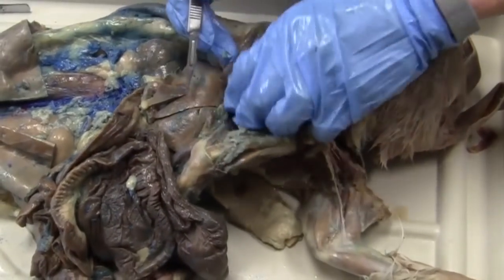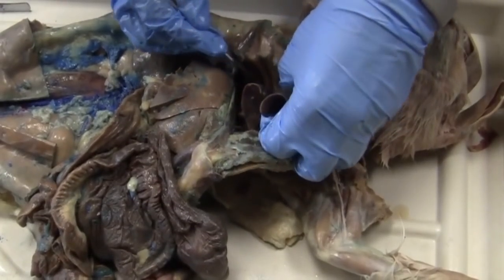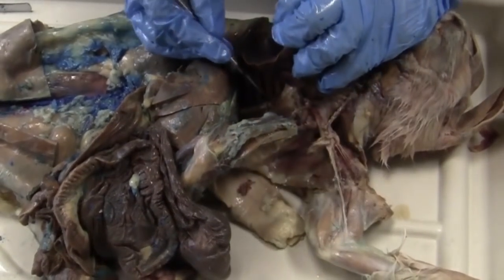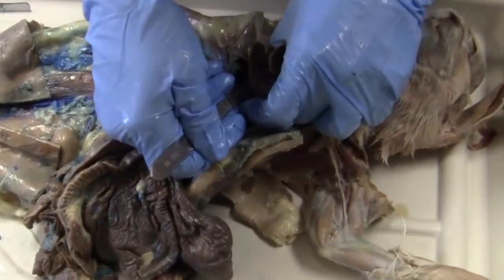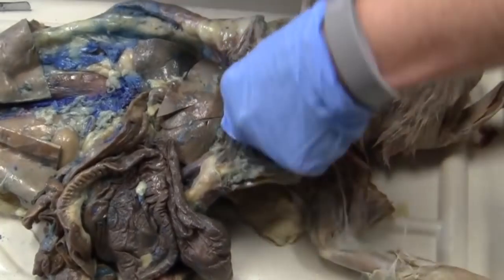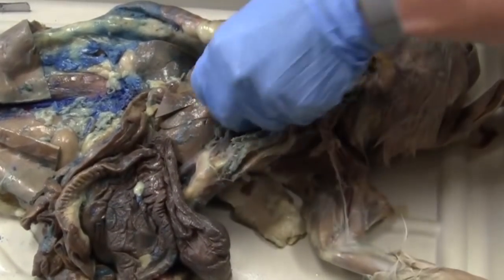And then I also am going to need to find and cut the azygos on the back side. Cut the aorta once, make sure I got that cut. Okay. Then you can just kind of clean up this stuff on the back side. Cut the trachea.